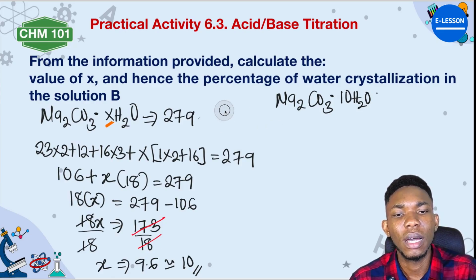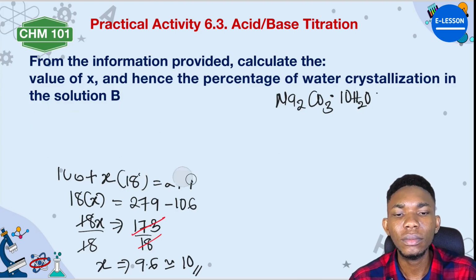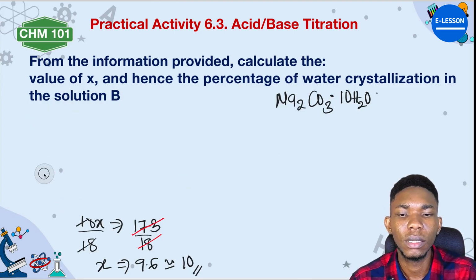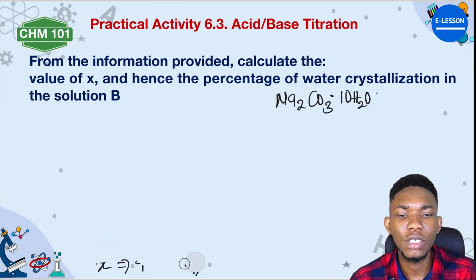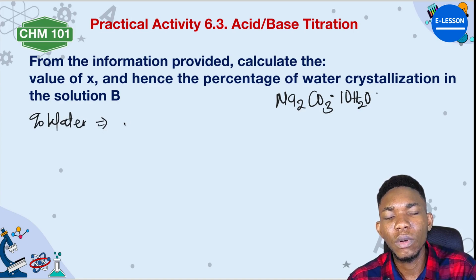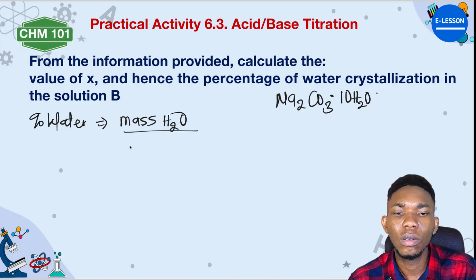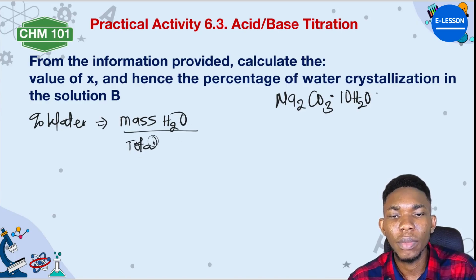You can pause and write the previous one. So percentage of water is equal to the mass of water all over the total mass of compound.